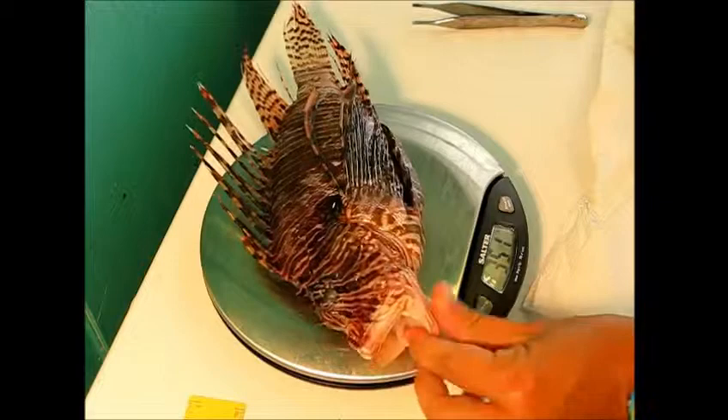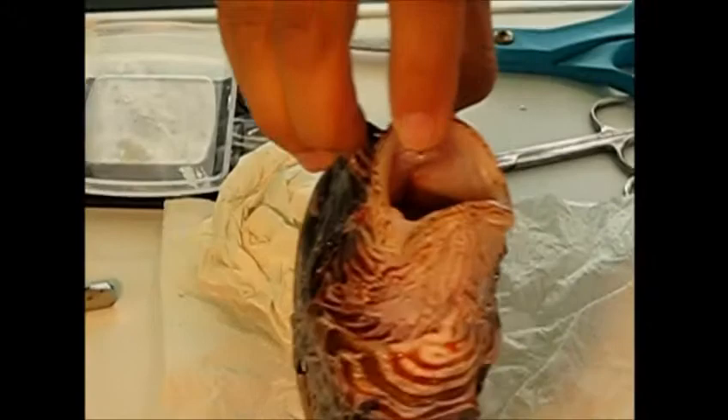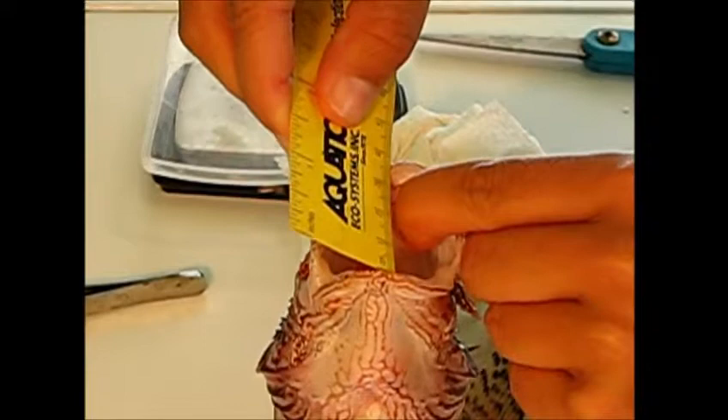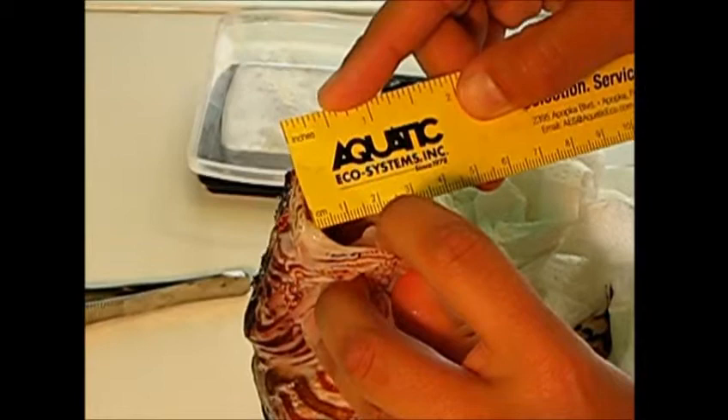The next external measurement we're going to take is gape height and gape width — basically how big the mouth is. We're going to open the mouth as wide as it can go and then measure gape height in millimeters. It's 35 millimeters, and then gape width is 34 millimeters.